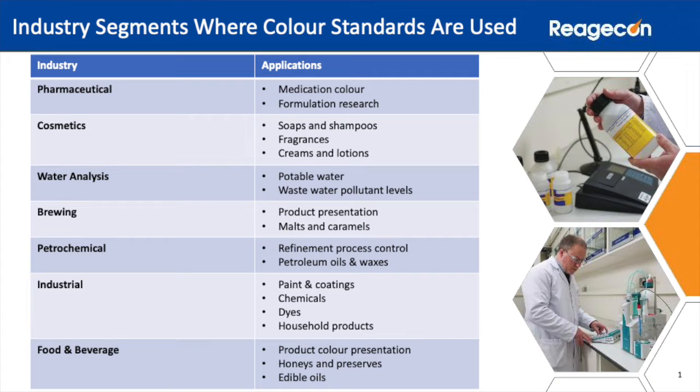The measurement of colour is now an exact science. This is due to the simultaneous evolution of high-quality instrumentation and high-quality standards to calibrate and control this instrumentation. Colour measurement is also a highly sophisticated science, and accurate measurement is necessary in almost every industry.